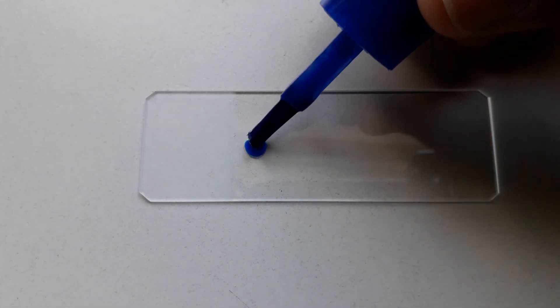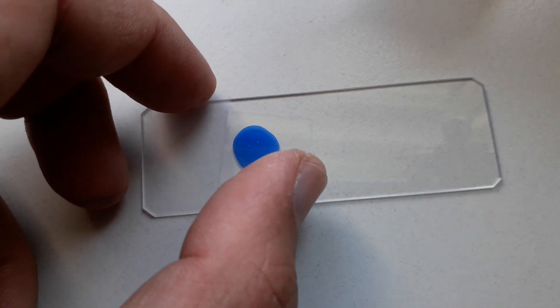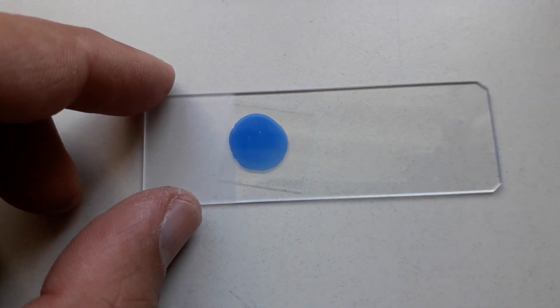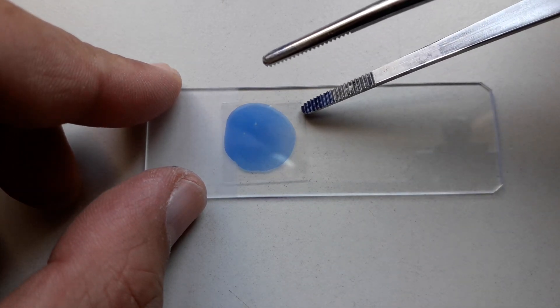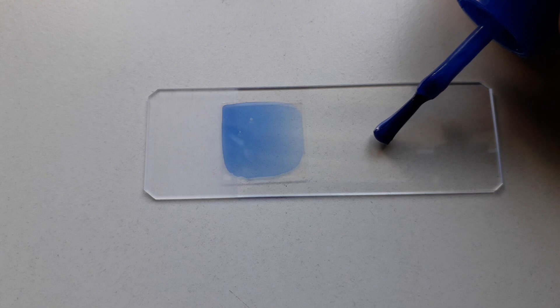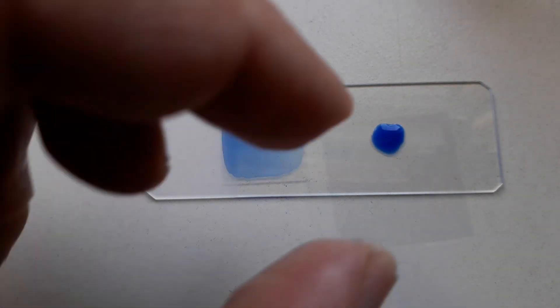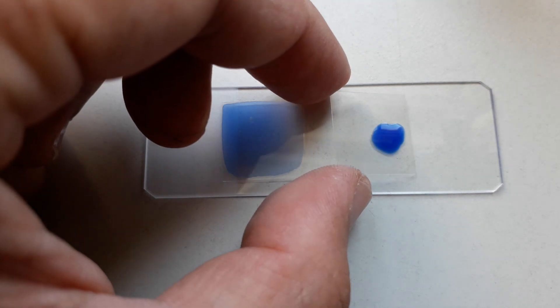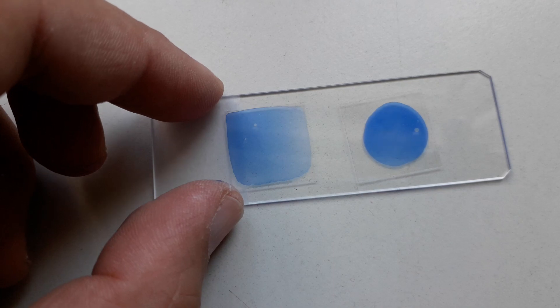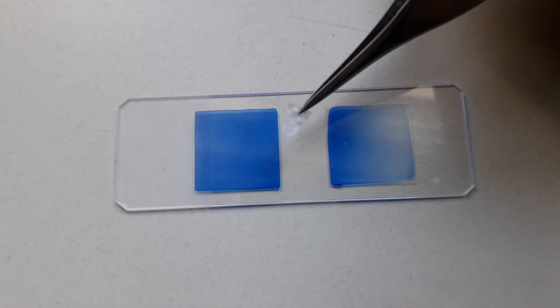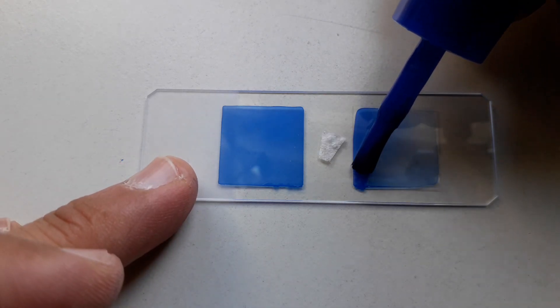Another possibility would be to use the nail polish to make such a spacer. Now I'm using the nail polish to glue two cover glasses to the slide. The cover glasses themselves will now act as a spacer. This is also quite easily done, as you can see. Do not use too much nail polish, otherwise it's going to take too long to dry.